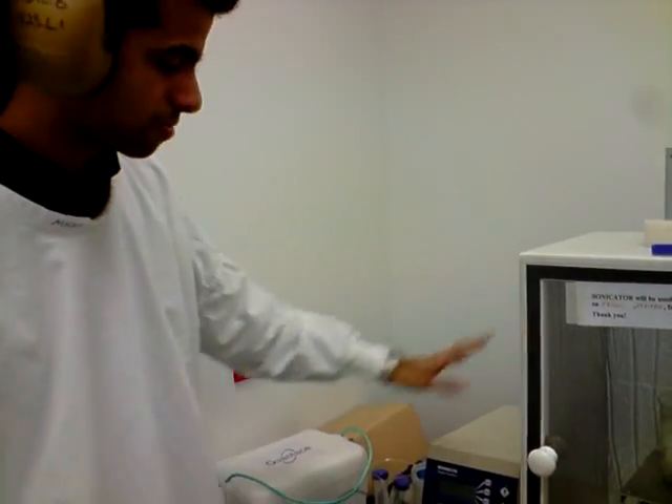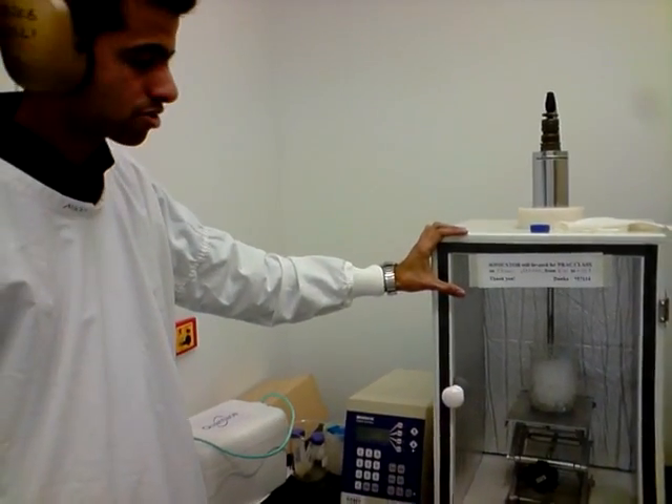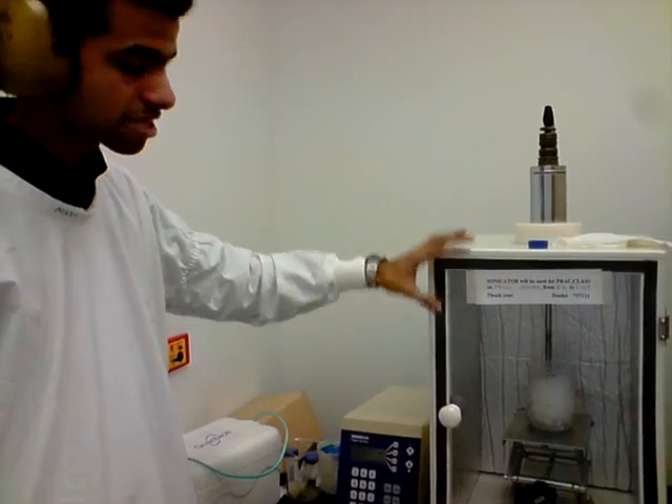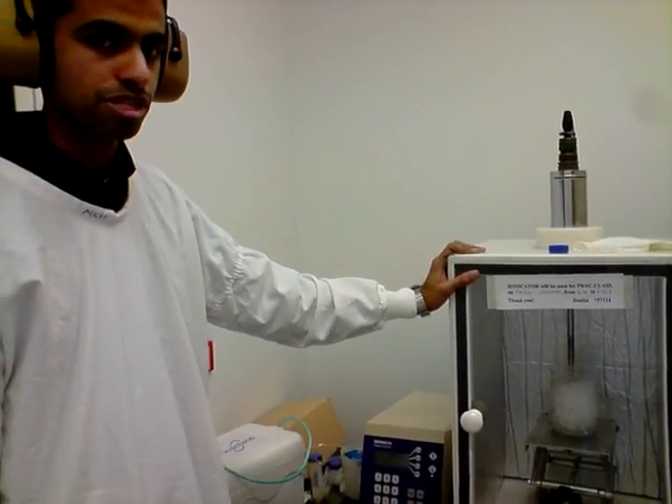As you can hear now, it has stopped for 30 seconds automatically. It will allow the solution to come back to the cold temperature for 30 seconds, and again for 30 seconds it will start and continue the same procedure for 3 times.